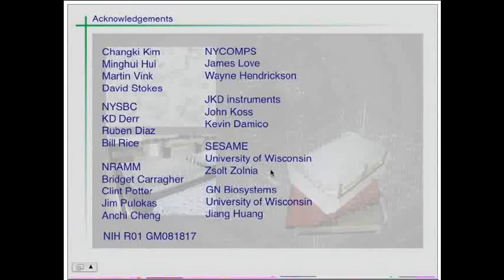It takes about 10 minutes to exchange grids. We realize that for that, the vacuum of the microscope has to equilibrate and so on. So the robots are fast. The limiting step is how fast you can acquire vacuum after you break the air lock.